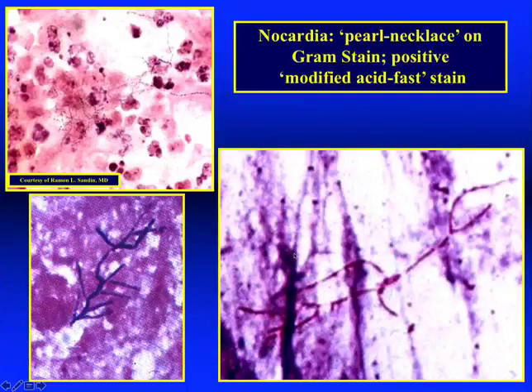This is nocardia. Nocardia with a gram stain is filamentous, branching, beaded. When we use the modified acid-fast stain or nocardia stain, it then looks like a red snapper. Not the red snapper with the long bacillus morphology of Mycobacterium, but a red snapper with the morphology of nocardia, which is a member of the actinomycetes, the higher bacteria that are filamentous branching.